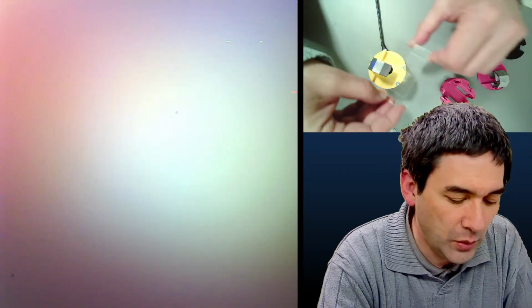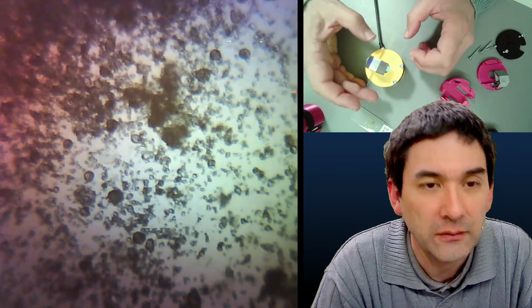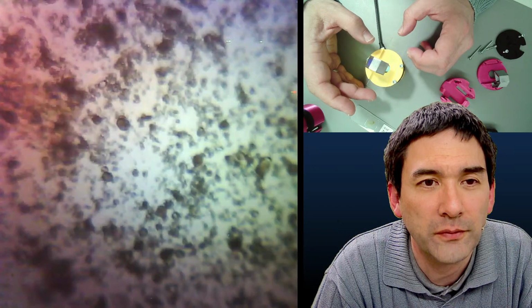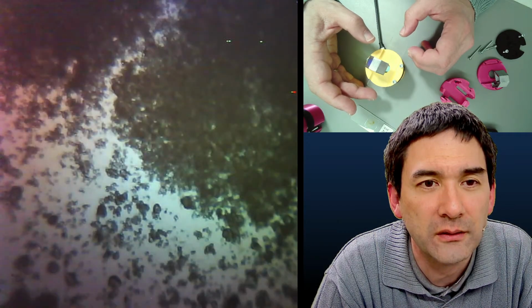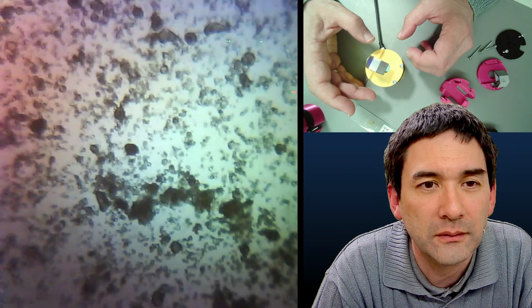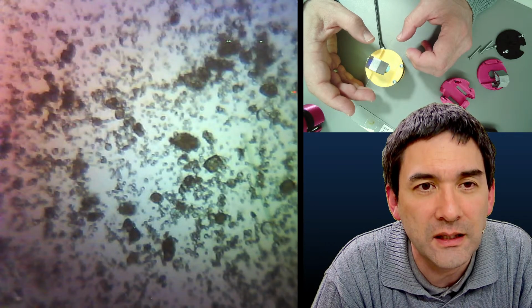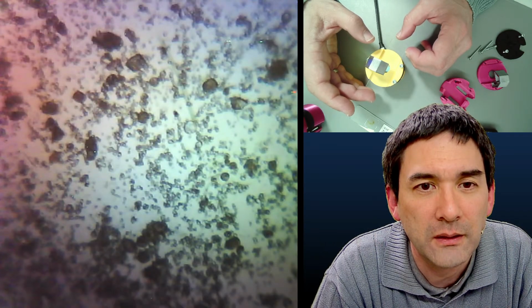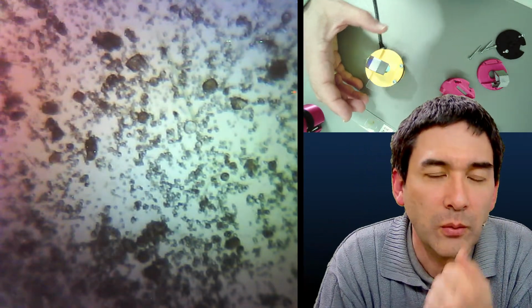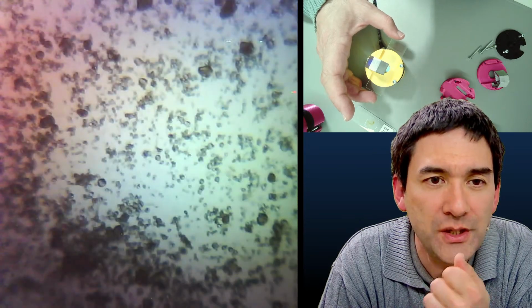This is a water sample that I just prepared. There were actually a whole bunch of ciliates in there. Oh, there was a rotifer maybe. And you can see that it is not a very fast thing because there is a little bit of movement. It's not very fast because the wireless connection is not very fast. But for still images, it's perfectly fine.